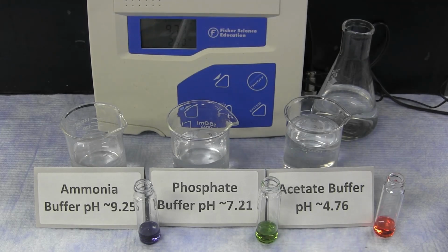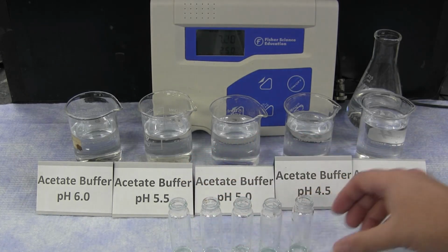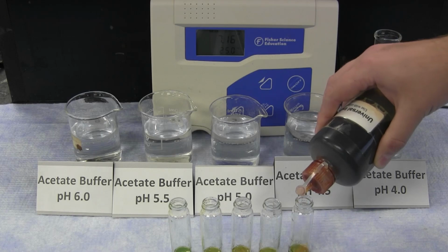All of these buffer solutions are prepared using conjugate acid-base pairs, and the different pairings based on the equilibrium constants generate buffers that are hovering around a specific pH. While the general pH of a buffer is determined by the acid dissociation constant and the equilibrium constant, the specific pH of each solution is determined by the concentrations of the conjugate acid and base pair. All 5 of these solutions are solutions of acetate buffer, ranging from pH 6 to a pH of 4. If we look at these buffers using universal indicator, we can see the gradual pH range and how it changes as a function of the concentration between the conjugate acid and base pairing.